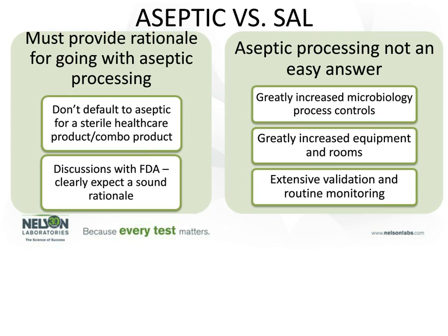There is a lot involved with setting up an aseptic process. There are greatly increased microbiology process controls. The equipment and the rooms are more expensive and require a lot more maintenance, a lot more extensive validation and routine monitoring in those rooms and with the equipment as well. So it is certainly not something that should be leaned on as an easy out to terminal sterilization.